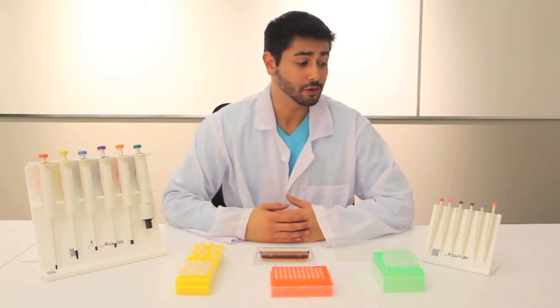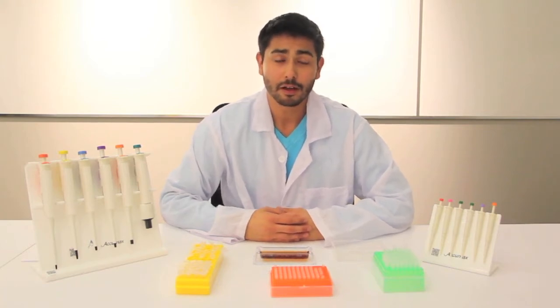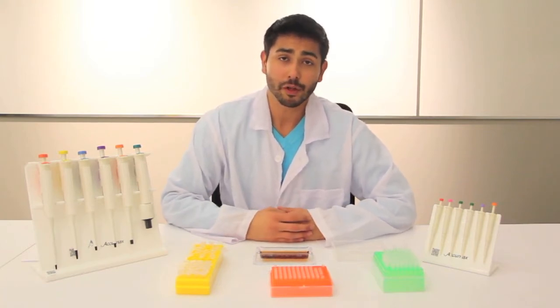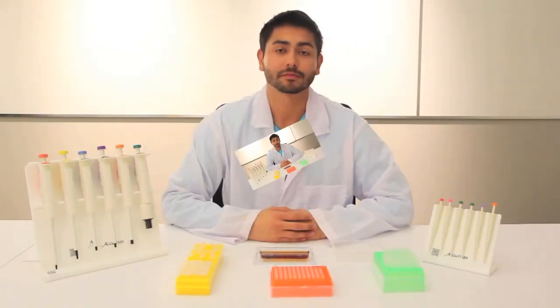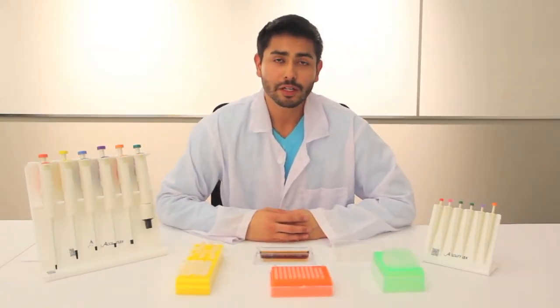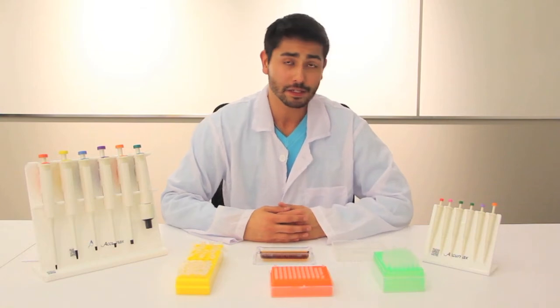The AcuMax Juniors are great for educational labs, as you don't have to worry about them breaking with first-time users. They are disposable pipettes, and as mentioned, with a three-month warranty — if anything happens within that three months, we'll replace it. Real World Education has chosen the AcuMax Junior Pipettes for their basic skills training for their affordability and ease of shipment.